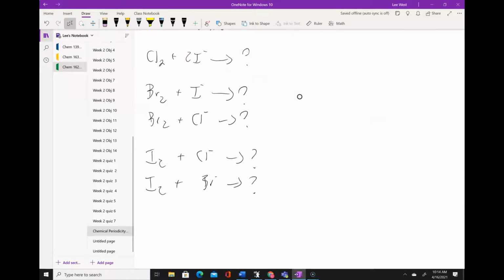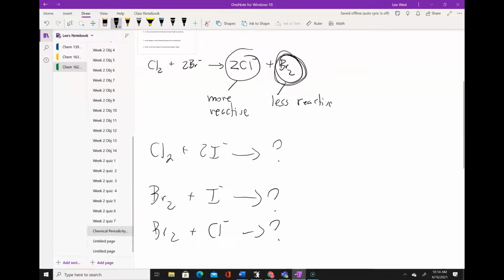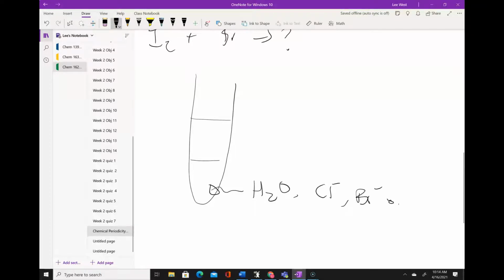So then the question becomes, we need a mechanism for identifying what ends up neutral and what ends up with the negative charge. And so what we're going to do is establish a system where we have two immiscible liquids. We have a bottom layer and a top layer. The bottom layer is the more dense layer. It's going to have water in it, and in the water will be your ion: either chloride, or bromide, or iodide.